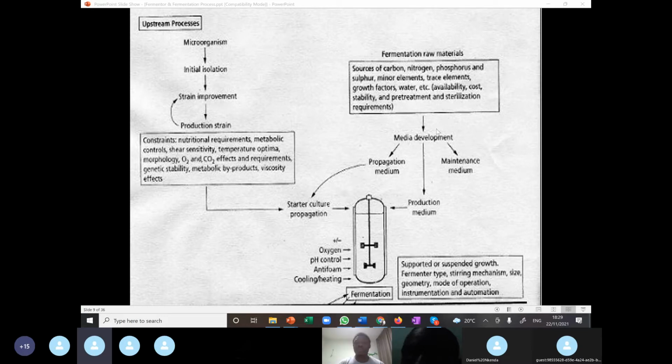So when we have our substrate, as I already started indicating, we might have a different substrate for the maintenance of our media and a different substrate for the fermentation process. Okay, so know that there could be a substrate for our culture inoculum and a substrate for fermentation. And in some cases, it might be the same.